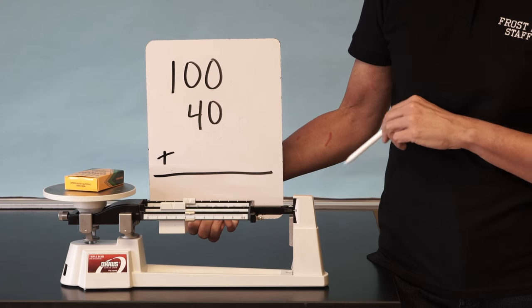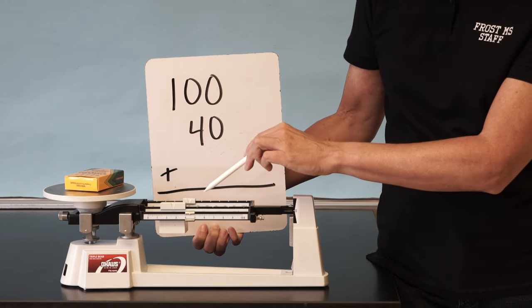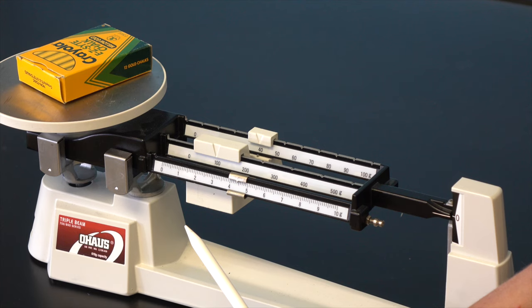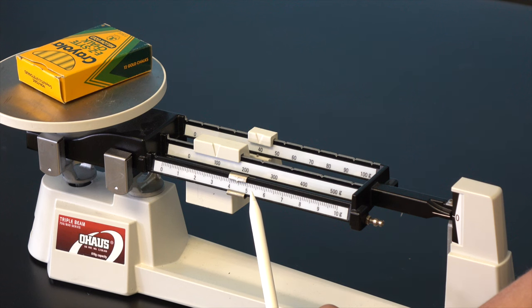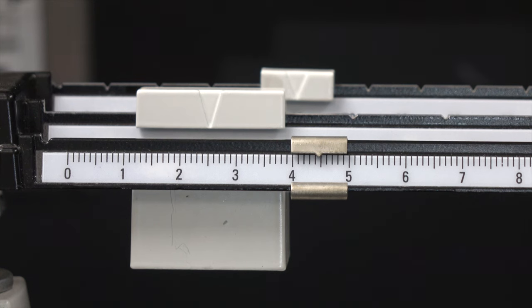That gives us 100 plus 40. And the reading on the front rider is between 4 and 5 grams. And since there are 10 small marks between the 4 and the 5, each of these small marks represents a tenth of a gram. And the pointer has passed the fourth of these smallest marks. So that makes the reading on the front beam 4.4.